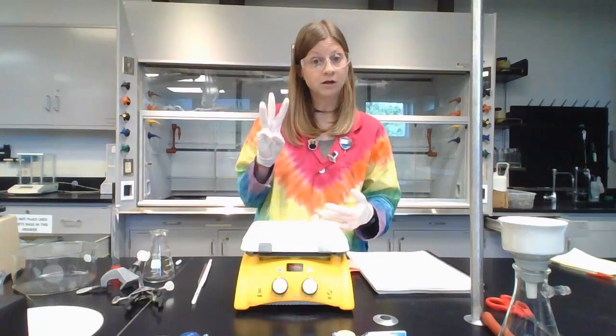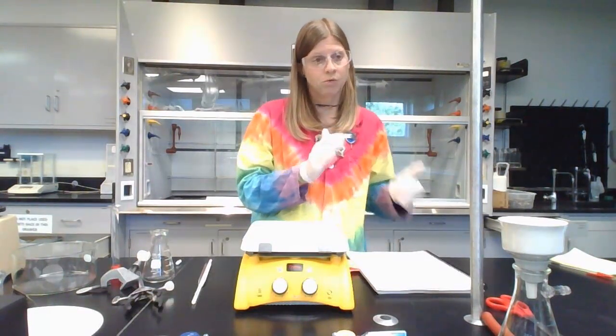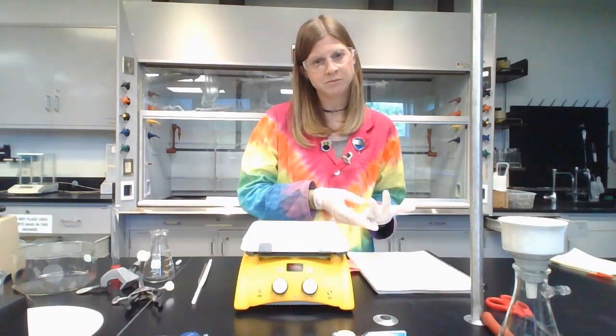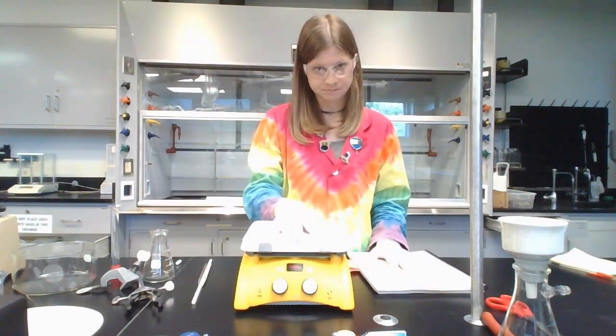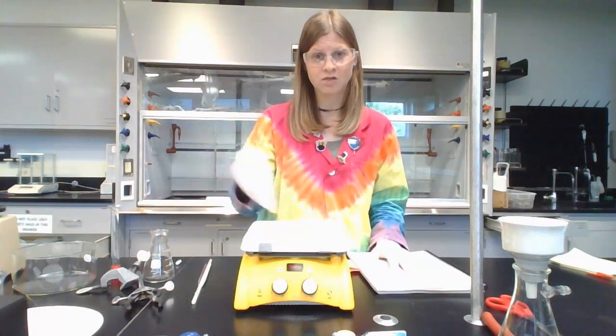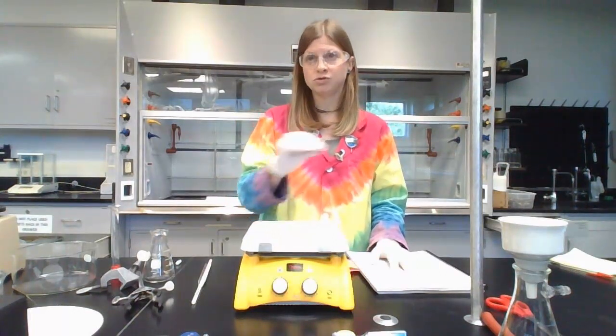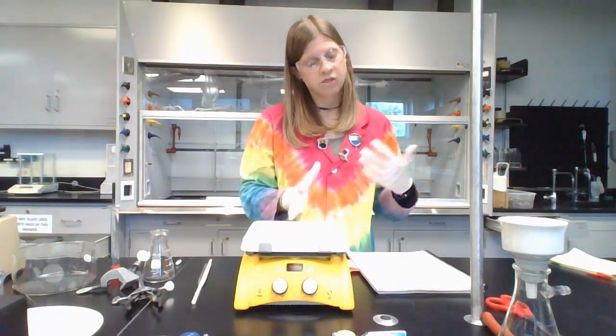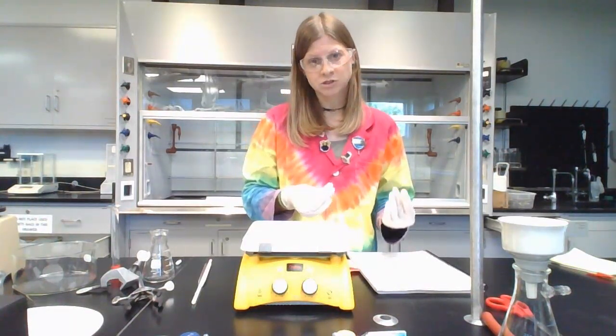So it's a 3-part lab, but with organic chemistry labs, it's not like a lot of the other labs that we've done, where you do part A first, and part A is, do this, I accomplished it, check. And then part B, we do it second, and we accomplish that, which is a different thing than we did in part A, check. There's a lot of waiting around in organic chemistry labs.